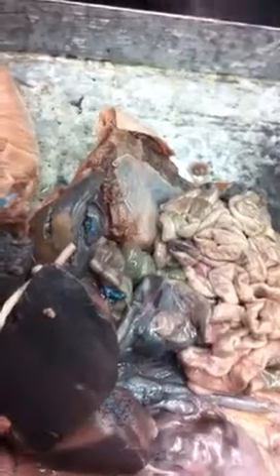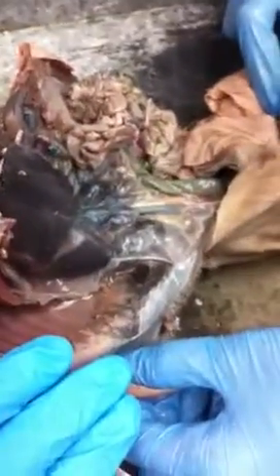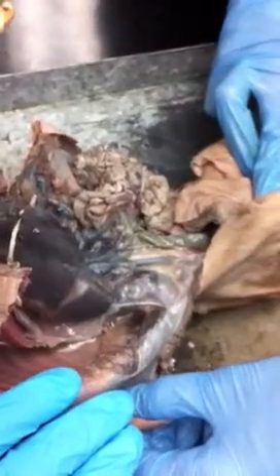And our inferior mesentery? Over here. Oh, inferior mesenteric. Oh. Okay. Well, it's been like 5 years since I looked at a pig. Okay, so inferior mesenteric should be... Let me see in the picture just to make sure I'm not looking in the totally wrong spot. Inferior mesenteric goes to the large intestine.